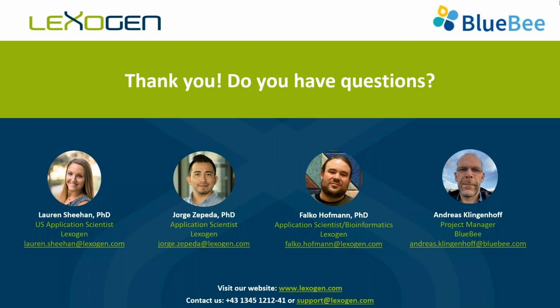Thank you, Lauren. And another question: is your RNA-Seq analysis pipeline open sourced? So I can go ahead and take this one too. It is implemented using well-established open source tools, and a more detailed description is available in each of our user guides and also on the Quantic product page itself.